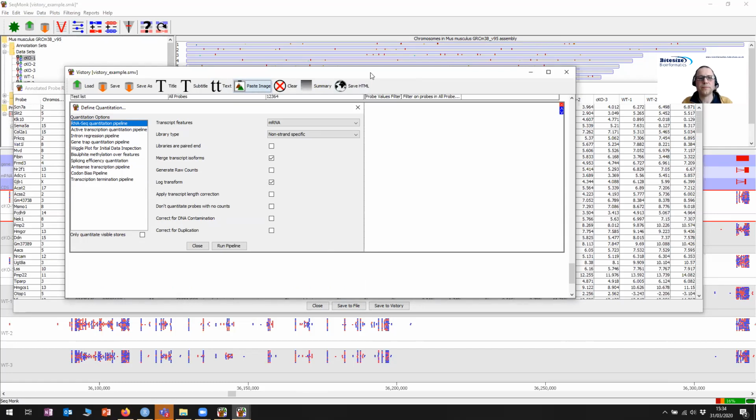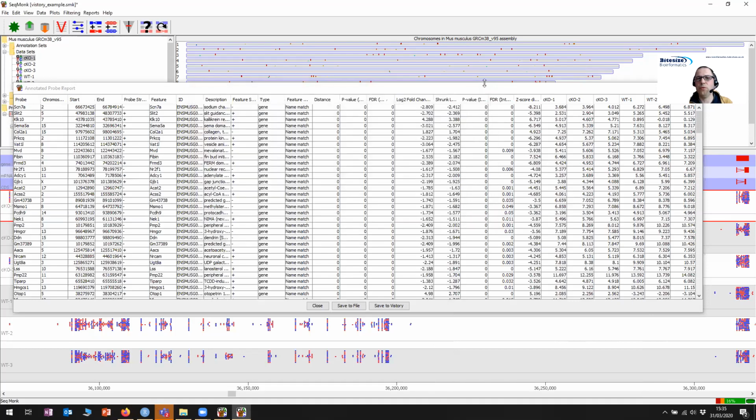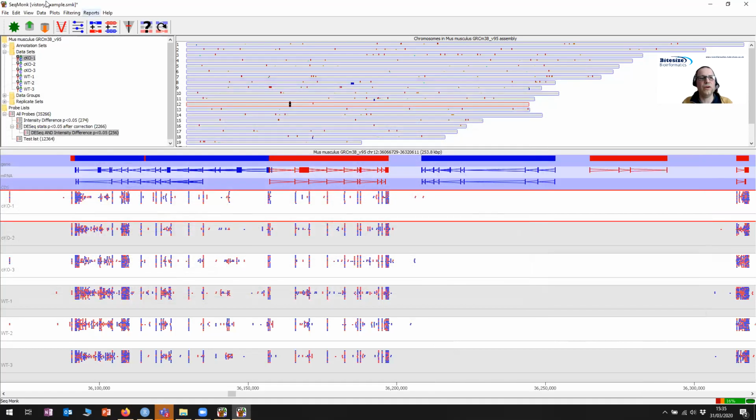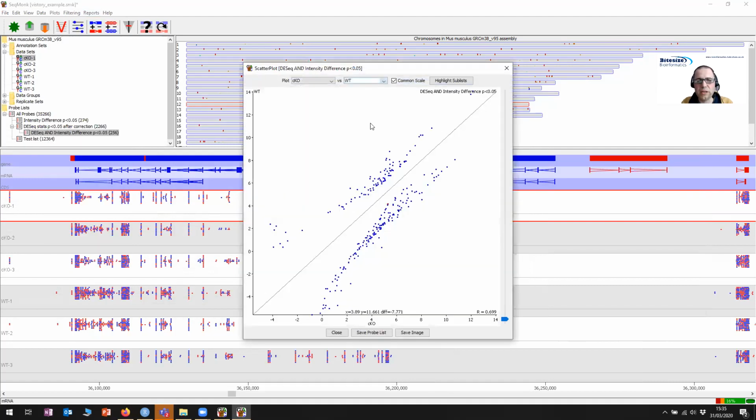So if I, for example, find a really interesting gene, so if I have my scatter plot up and I decide, oh, sorry, let me go back to everything.